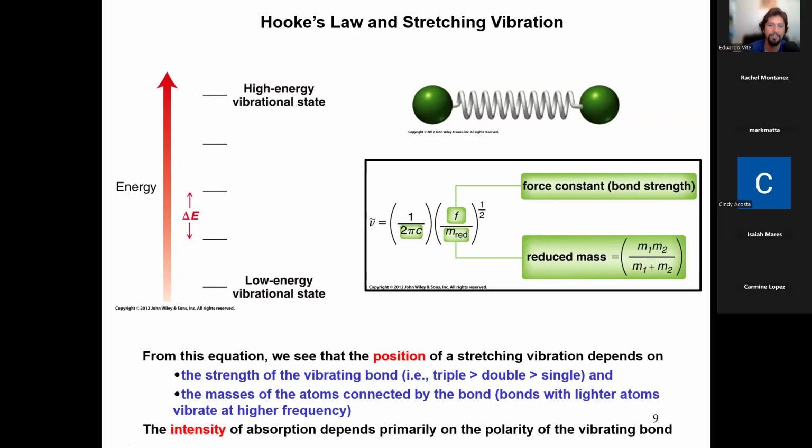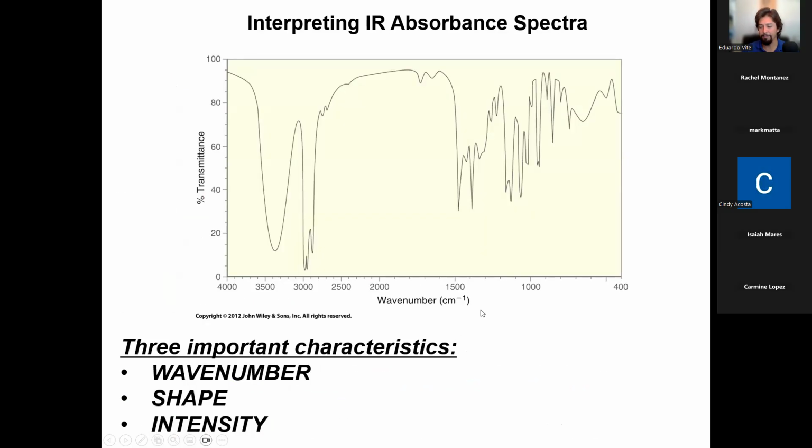And yes, we can predict where it'll vibrate and we can predict what kind of vibrations it'll have. But you can take thermodynamics and you can take statistical chemistry if you guys are interested in that stuff. But again, we just want to show you that all of this is real. There is a real physics and reality foundation to all of this. This isn't stuff that we're just making up. So when we're looking at these graphs, they mean something. They mean something real, and they give us real information. Okay? Alrighty. So that was the theoretical background.